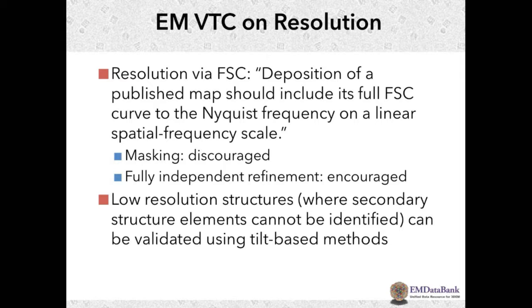Well, I do know that there are some cases where you don't see this beautiful sigmoidal shape, and that tends to be for membrane proteins. With TRPV1, whenever you look at their FSC, you see kind of two bumps. It doesn't really fall off as nicely. Somebody told me a good reason for that.